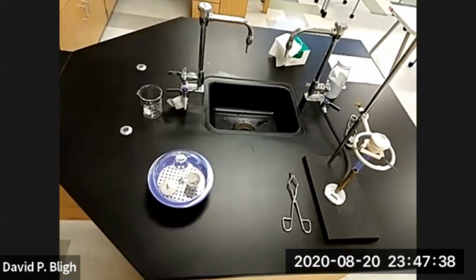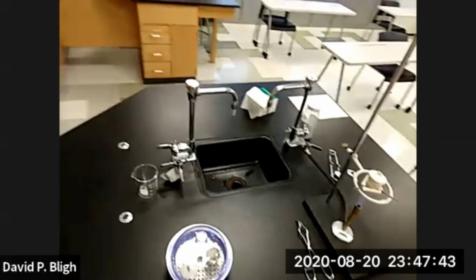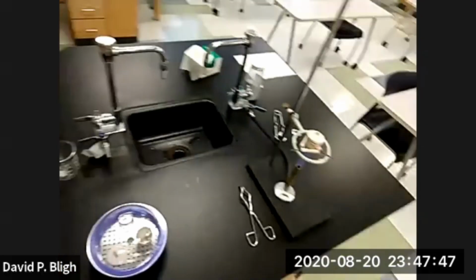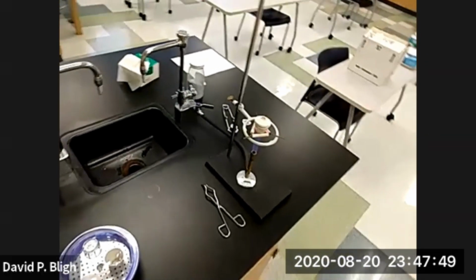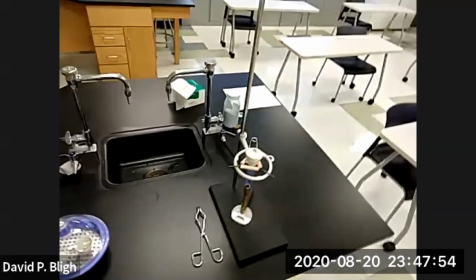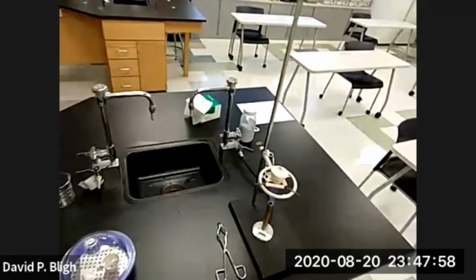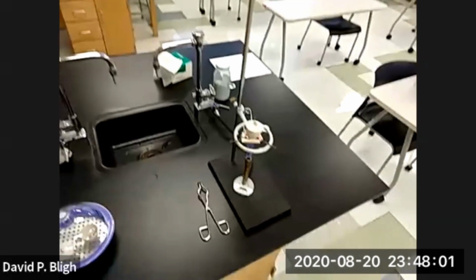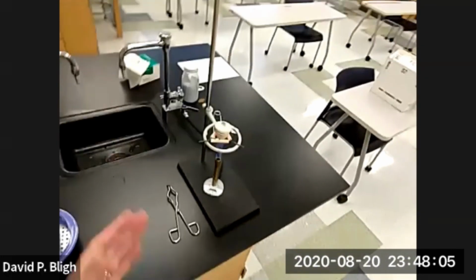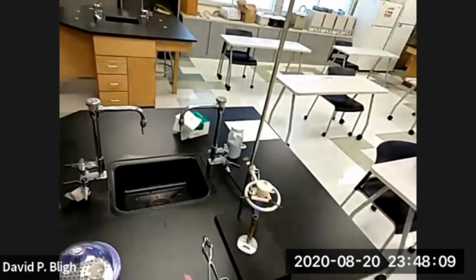Couple more minutes, and we'll be able to get the tare weight, T-A-R-E, tare weight of our second crucible. Now, if we had a lot of crucibles and we were going to do this experiment multiple times, then we would want some way to mark the crucible with a number so we could identify it for each sample, because you don't want to mix your samples up in the process. Sorry for the shake.